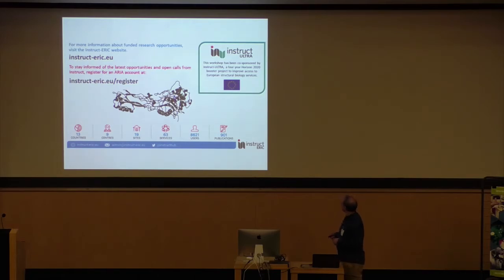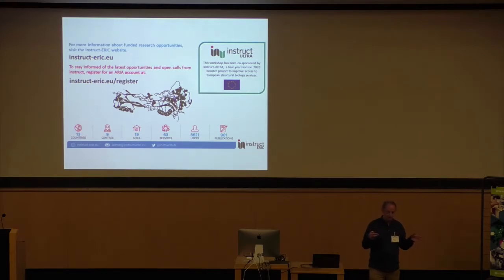Good, and then you see also here is Instruct Ultra, a specific European project associated to Instruct-ERIC, but the sense of that is actually to improve and facilitate user access. That means either developing tools, for example, how to collect data more easily, wherever it is, crystallography or EM, for example, or it is also to facilitate access for user communities which are not yet part of it.